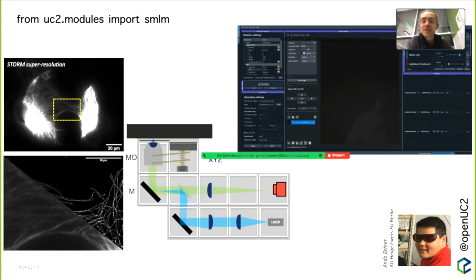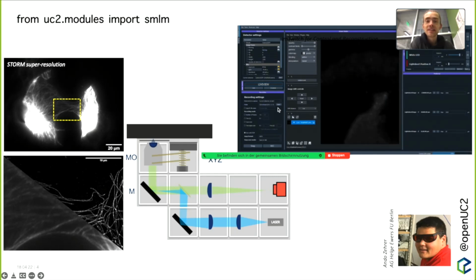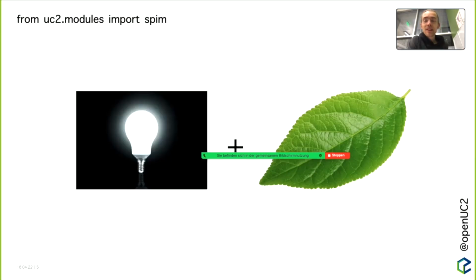And for this, you need all kinds of different things. So you need a good microscope from the hardware side. So you need triggering, you need lasers that are synchronized with the camera, etc. And all that was implemented inside ImSwitch. So what you see here is the GUI, where you see blinking from our sample here, and all very low cost. And something I'm working on right here.